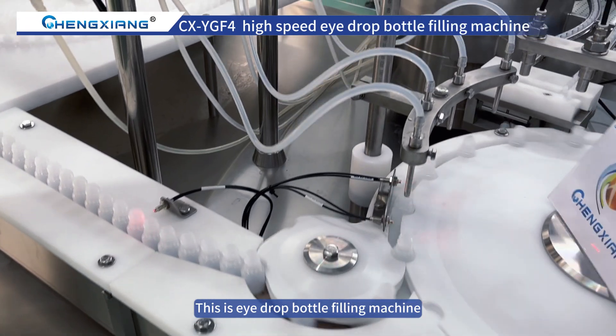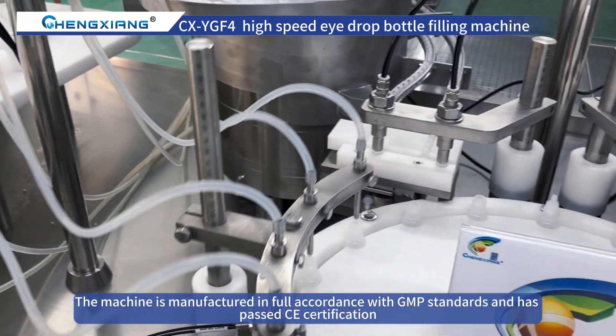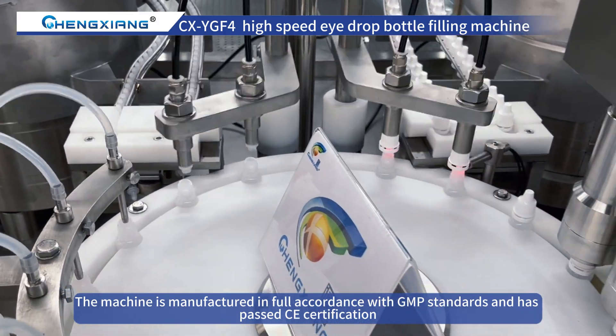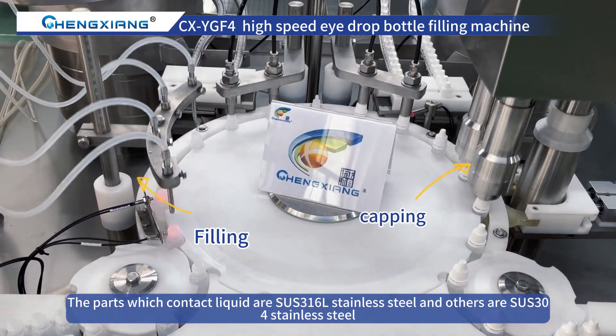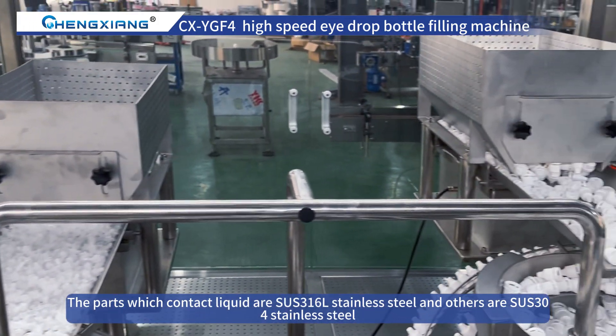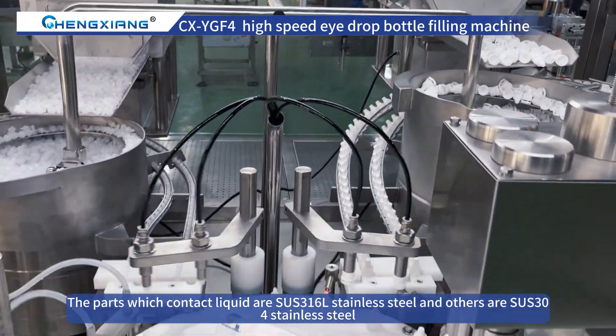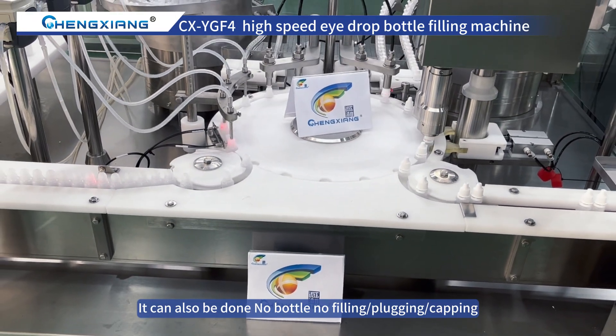This is the eyedrop bottle filling machine. The machine is manufactured in full accordance with GMP standards and has passed CE certification. The parts which contact liquid are SUS316L Stainless Steel and others are SUS304 Stainless Steel. It also features no bottle, no filling, plugging, or capping.